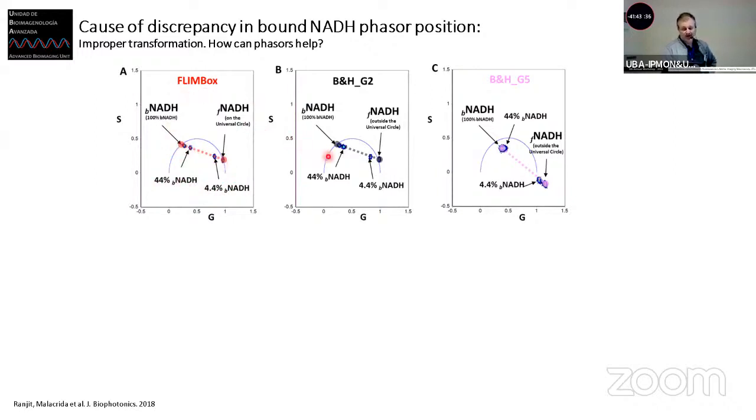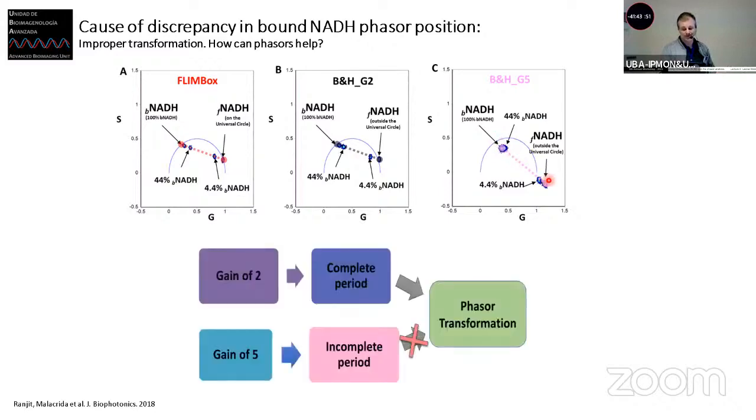In the frequency domain, and in the time domain, if you do this trick that we developed, it is easy and you get the same result. When you do the classical acquisition, you see that all the points are scattered around, and you can screw up your measurement.